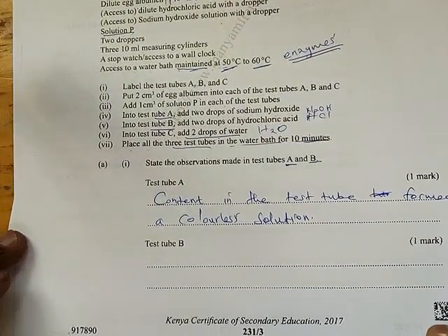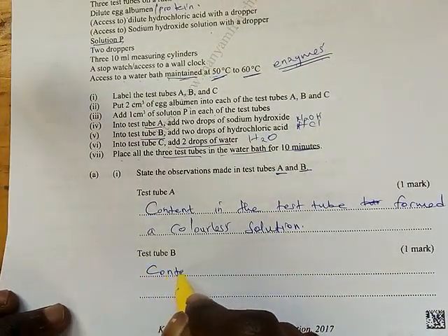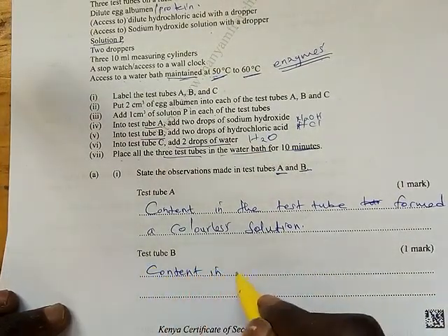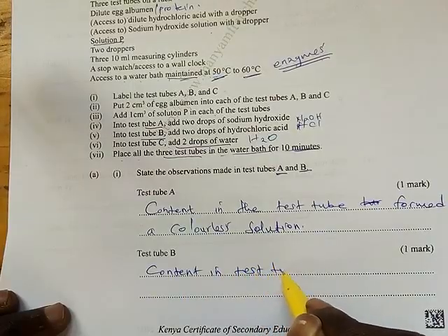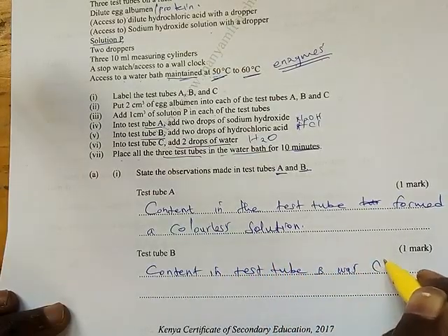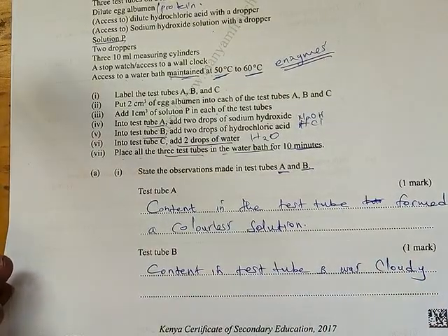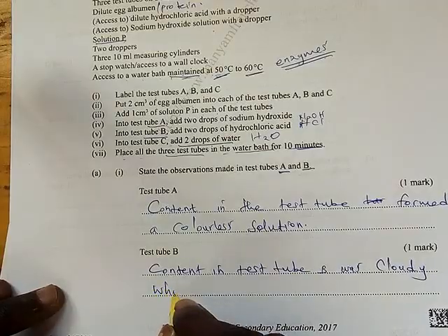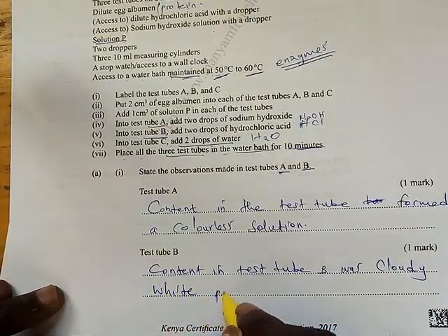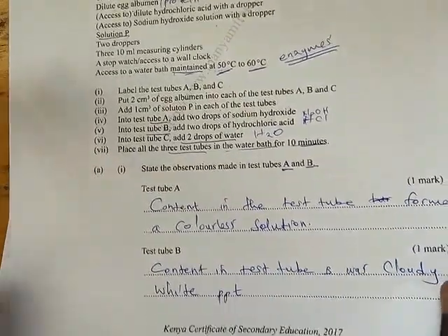While in B, content in test tube B was cloudy. Content in test tube B was cloudy or white precipitate or milky. Cloudy, white PPT, or it was milky.